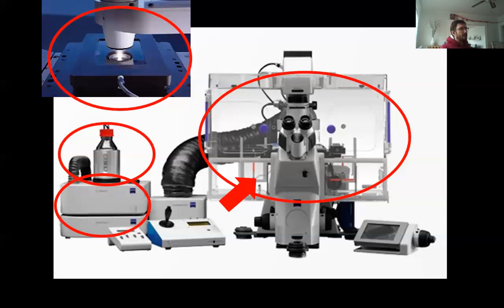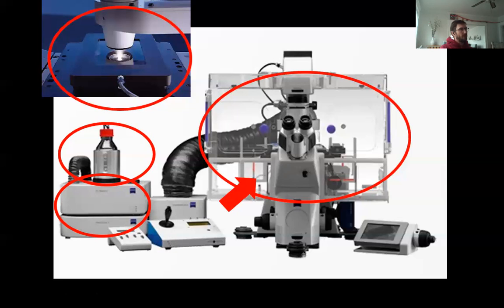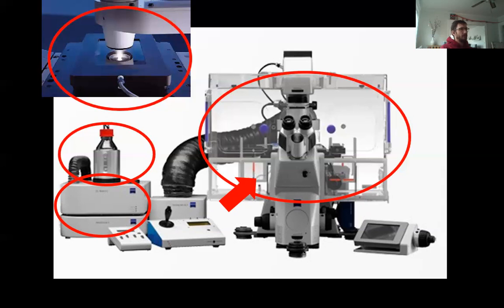Most of our microscopes also have a small black box on the side — that's our automatic focus unit. This allows us to compensate for any thermal drift that may occur while we're imaging. These are the basic components of a good live cell imaging setup.